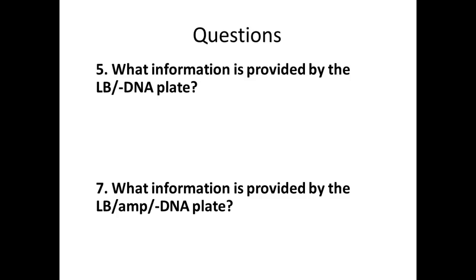So what information is provided by the LB plate with no DNA added to it? Why were we not adding DNA to our control? And in this case, this is just plain LB. It's just the food, right? It's just media, right? So what should happen? They should grow, right?